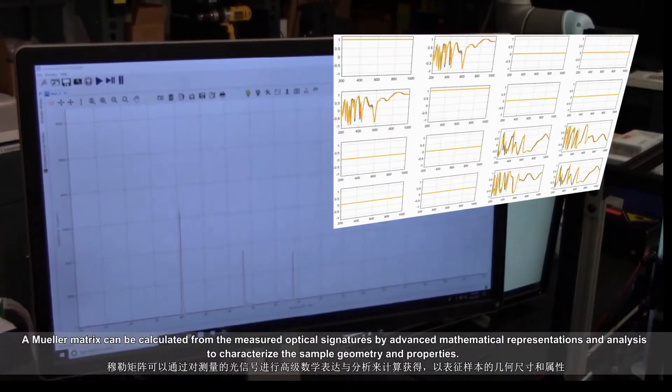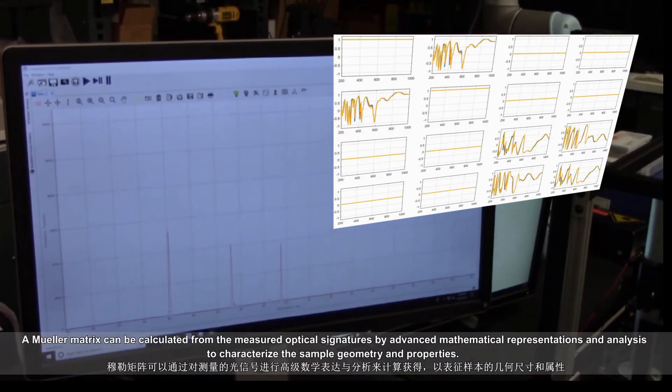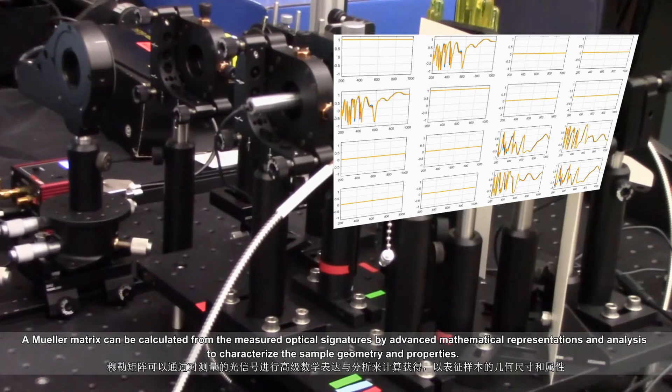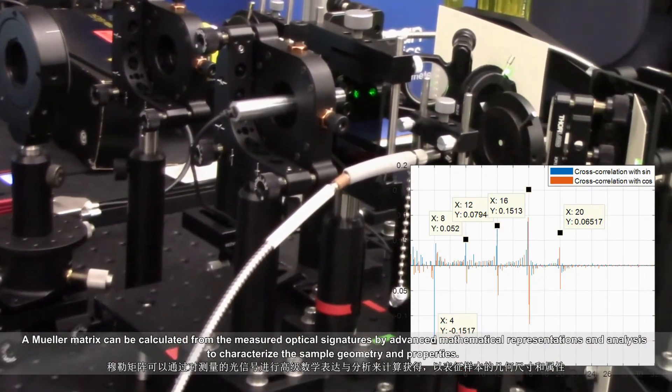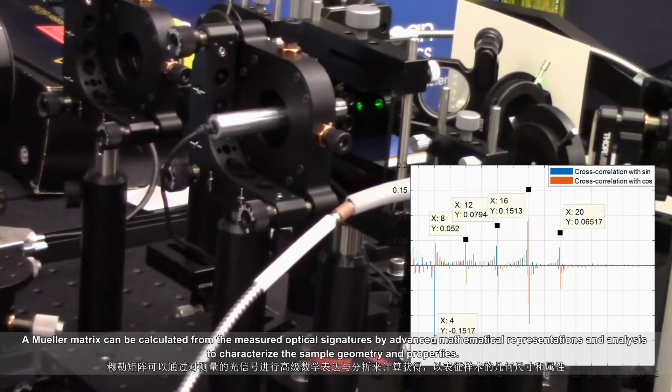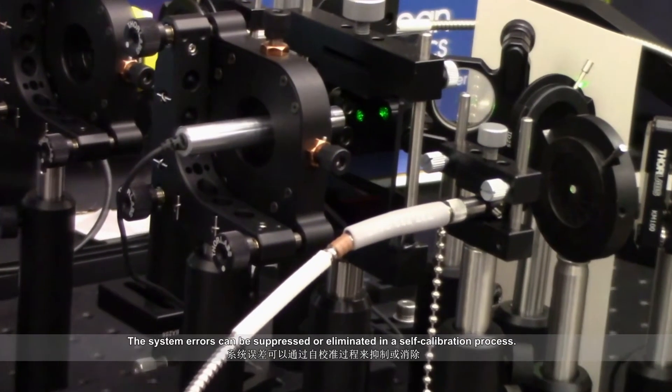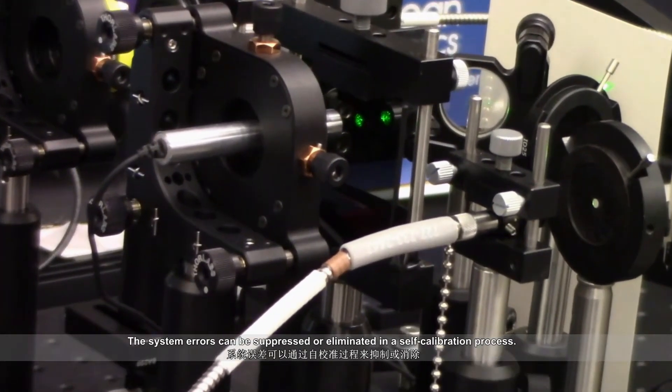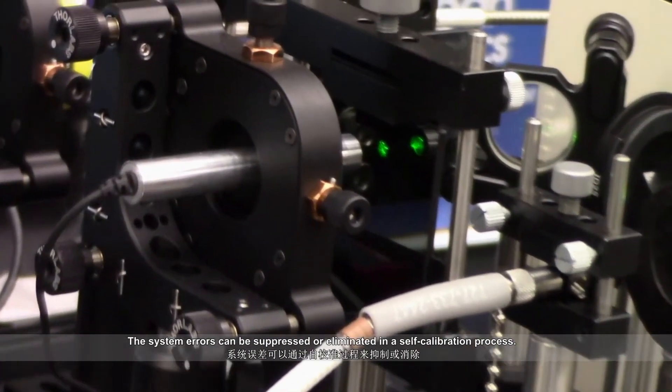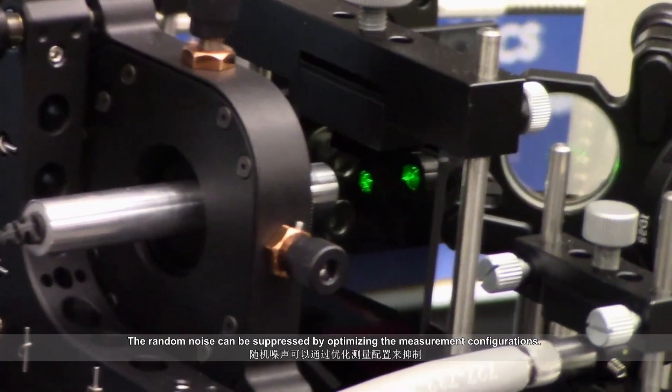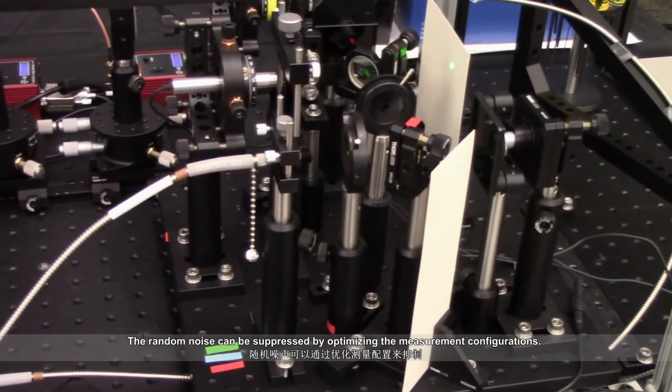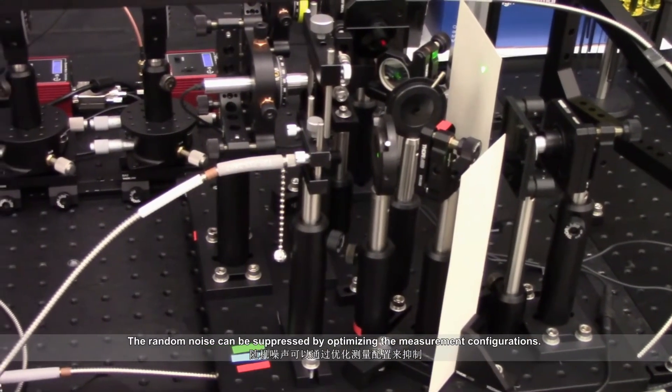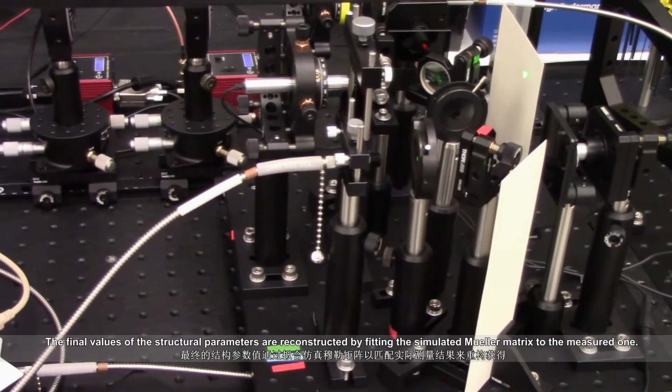A Mueller matrix can be calculated from the measured optical signatures by advanced mathematical representations and analysis to characterize the sample geometry and properties. The system errors can be suppressed or eliminated in a self-calibration process. The random noise can be suppressed by optimizing the measurement configurations.